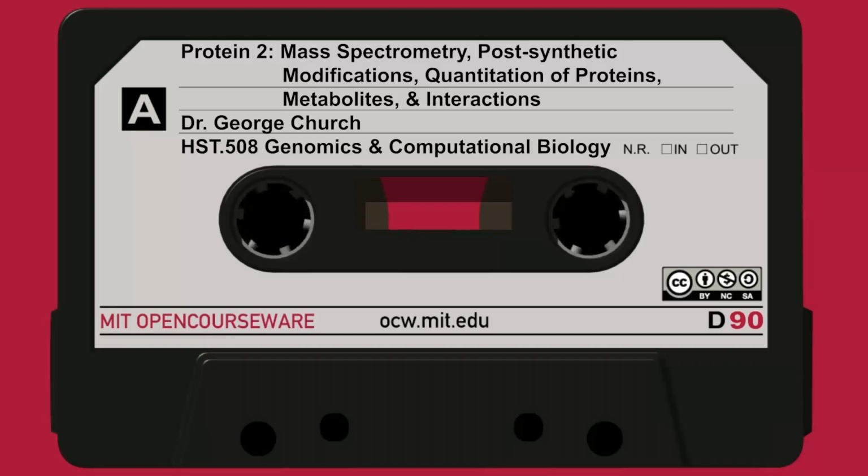And so, focusing on the blue series, the Y-ions coming in from the C-terminus, the shortest Y, the Y1, would be just the C-terminal amino acid itself, which would be arginine, and its distance from the origin would be about the mass of the arginine itself. And then you add a glycine to it, which is a small delta, and then an alanine and an isoleucine and serine and so forth. And you can see here very clearly the leucine and the asparagine and the valine for that Y-ion series, all the way down until the G is the last one documented.